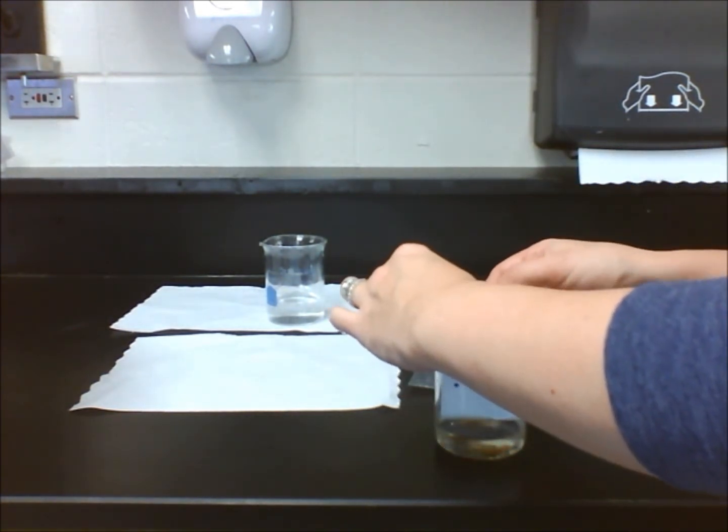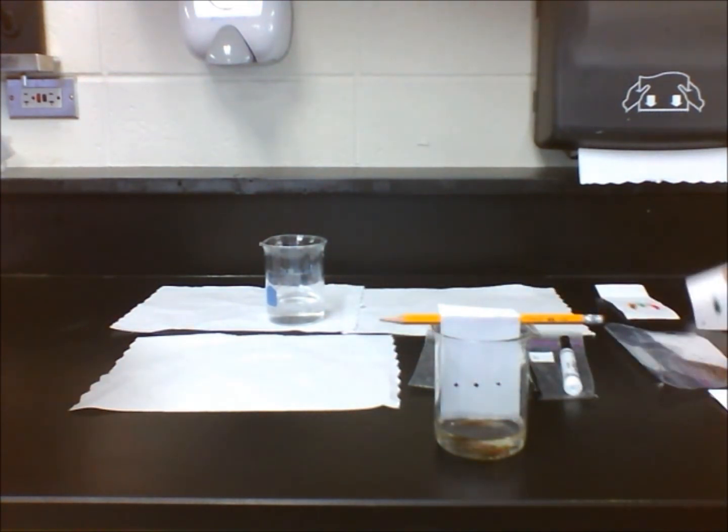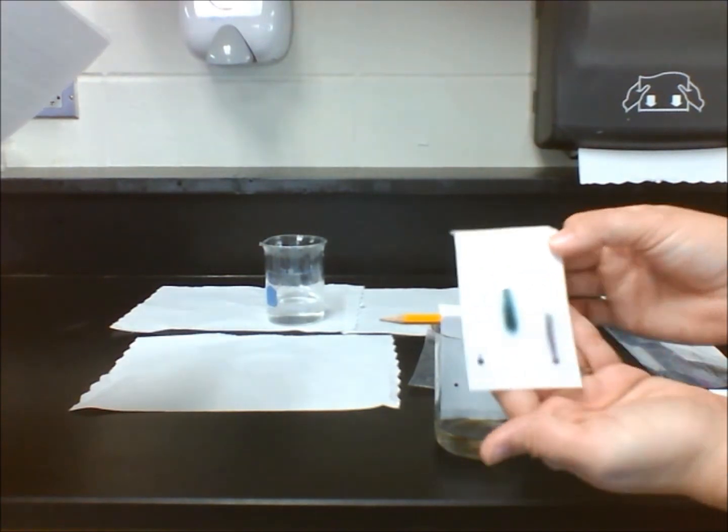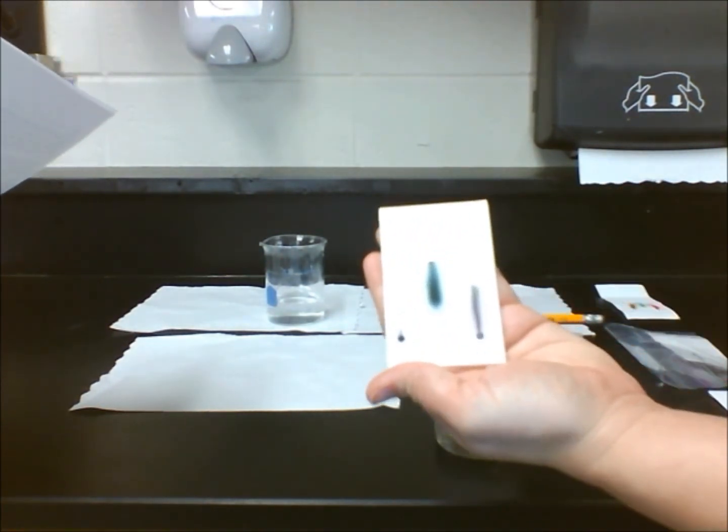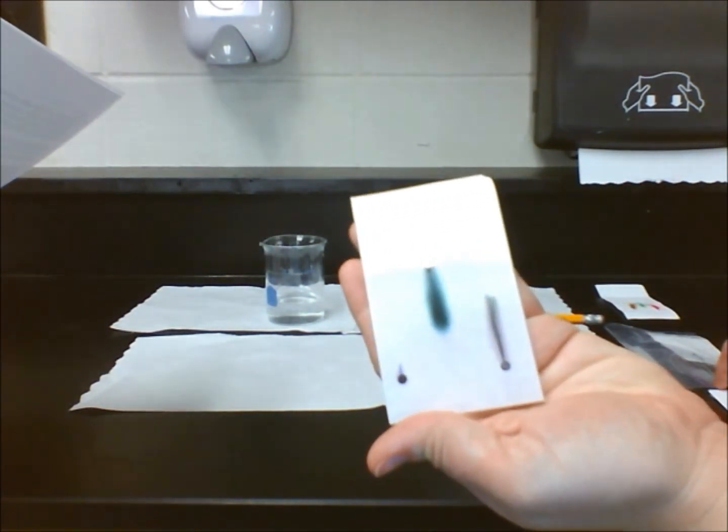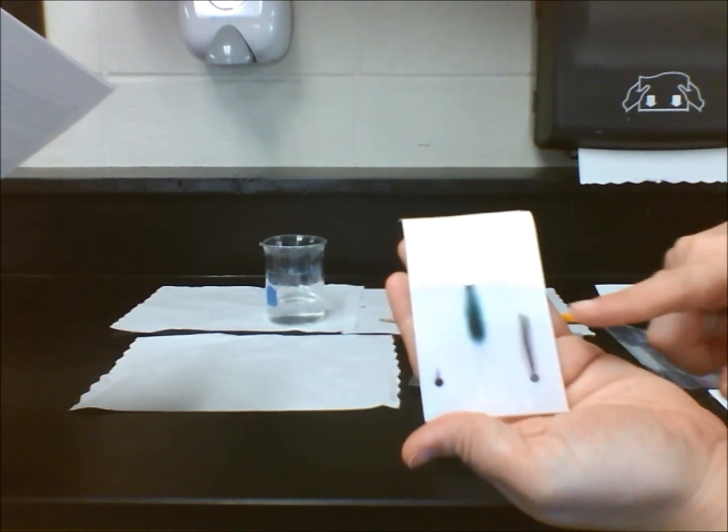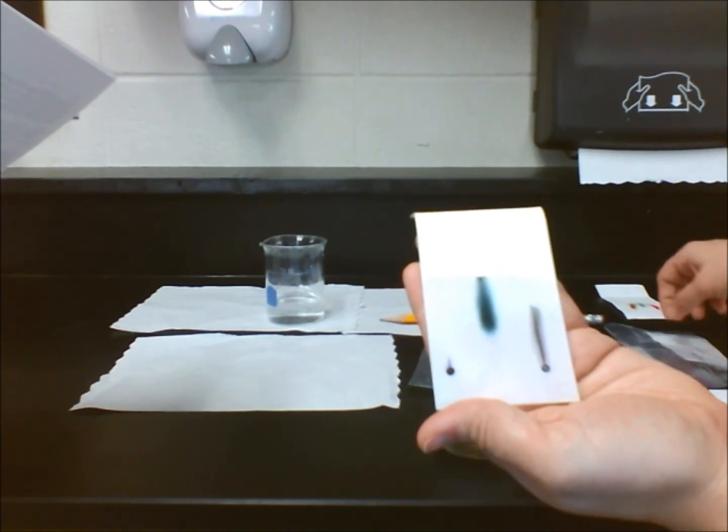Pen C is soluble and it's composed of a bluish solute. Pen D is also soluble but it's composed of a purplish solute. Its solubility rate is a bit faster than pen C's. Plus, it makes a very unique, thinly shaped pattern when traveling up the chromatography paper.